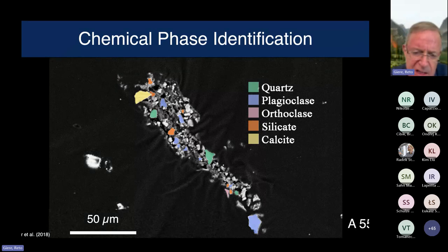And what you see here is the abundance of a mineral called quartz, for example, that's silicon dioxide. Plagioclase is another silicate with sodium and aluminum. Orthoclase, a similar mineral. And so there are various other minerals. Most of these are from the road surface. Some are from adjacent farmland. We can quantify that, and then we also can learn more about the brake abrasion particles, which we need to distinguish because chemically they're very different.